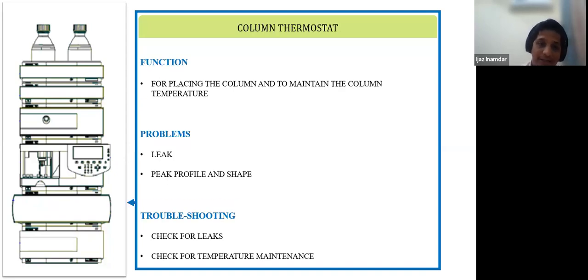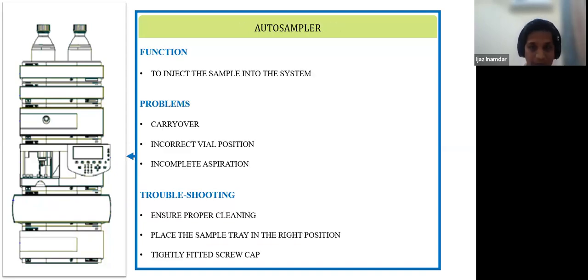So the other part, or I forgot to mention one important part: the auto sampler. You can use it as an auto sampler, but in certain cases you can make use of it to your advantage as well. Simply put, it is picking up the sample and injecting it into the system. We can use this as a small automated reaction platform as well.